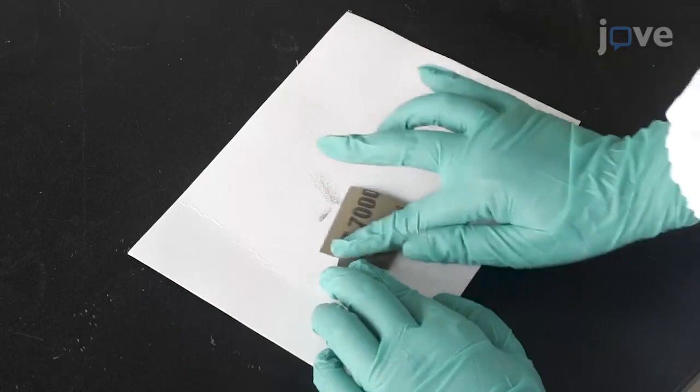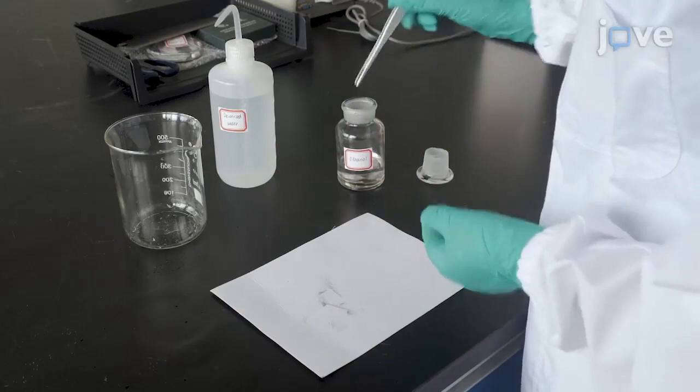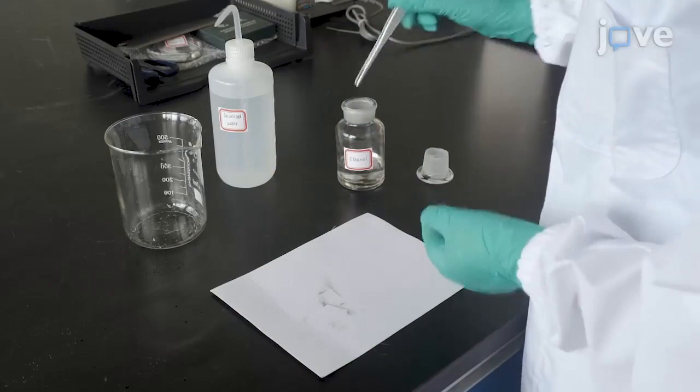Submerge the titanium foil in a volumetric flask containing 15 milliliters of ethanol and then a flask with 15 milliliters of acetone. Treat the foil for 15 minutes with an ultrasonic cleaner.